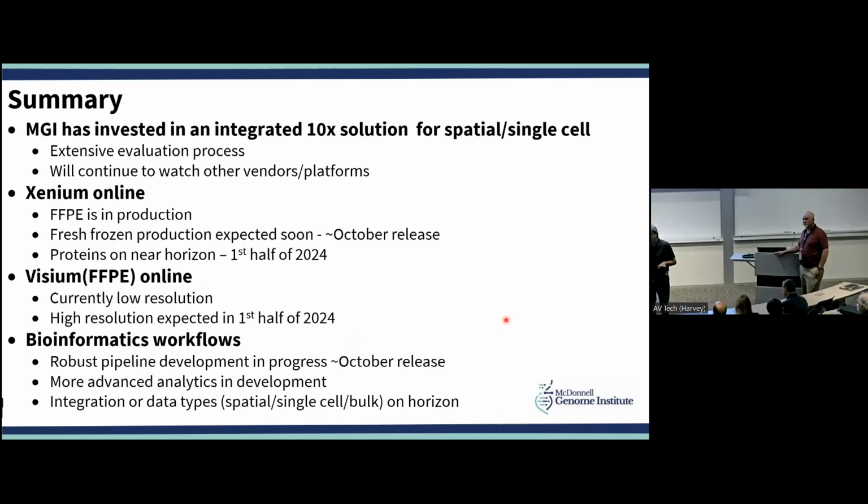In fact, right now it's very low resolution. You get these 50 micron, 55 micron spots. The HD will be much better. It will get you about to cell level resolution.